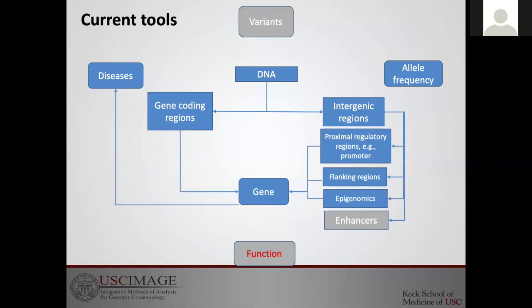In the past decade or so, many variant annotation tools have been developed, but most of them are focused on the data highlighted in blue in the middle here. Most of them require some bioinformatics skill in order to set them up and use them. There's no comprehensive functional annotation data included in those annotation tools. You will have to use separate tools to obtain this functional annotation.